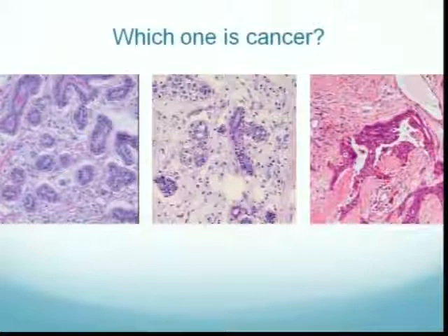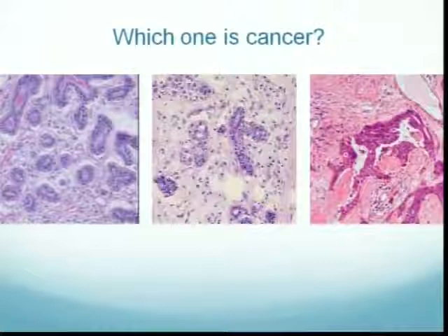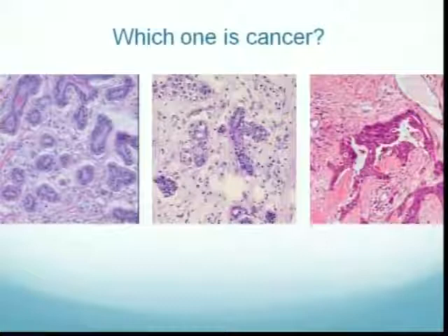So if you were to use this tissue just the way it is for an RNA-seq study, what you're really going to get is a mixed genetic profile. You're going to get the tumor, and you're going to get the normal. Now you say, Milan, my God, that is obvious. We would never use a tissue that has a ton of normal tissue in it, or do this study with a bunch of normals.